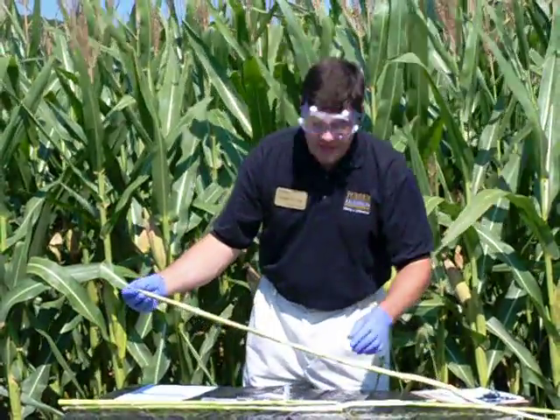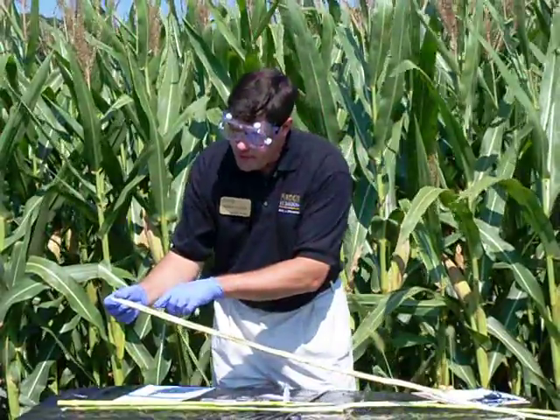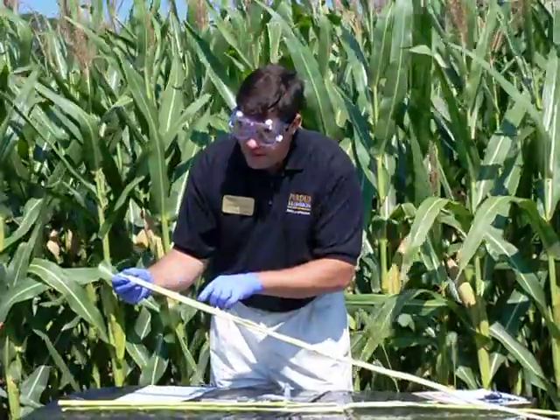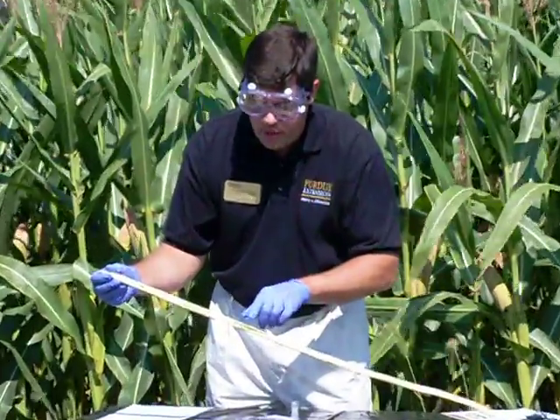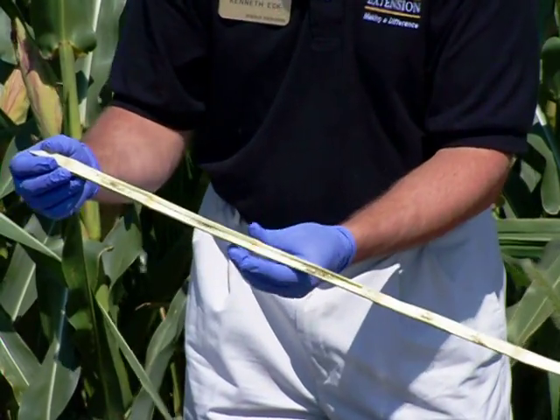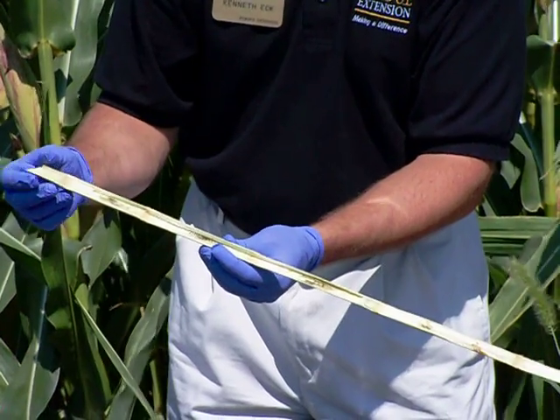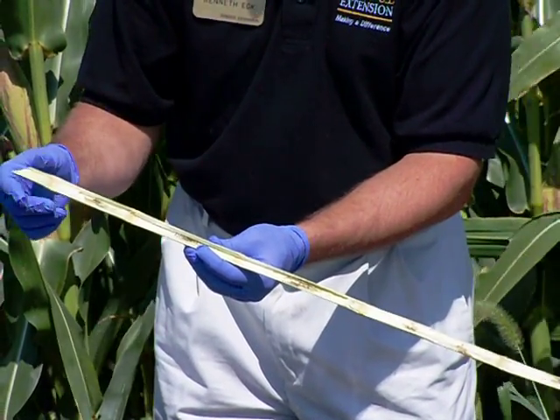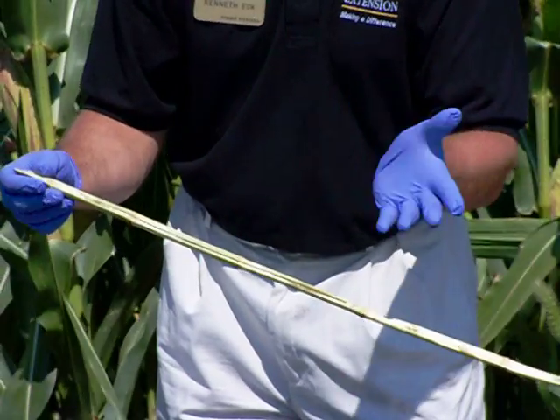The third stalk, which comes from a field nearby here, is showing that nitrate is not a concern. Basically, we do have a little bit of color change here, but it's mainly browns or light yellows or blues that are kind of mixed in with greens and yellows. So basically, this stalk I would not have much concern with in making a recommendation to a producer ready to feed this to beef cattle, of having a problem with chopping that.